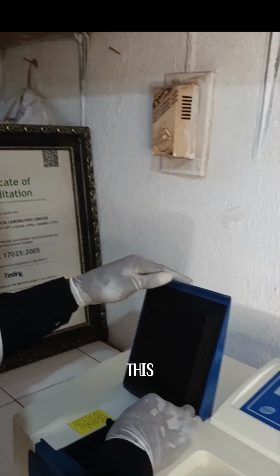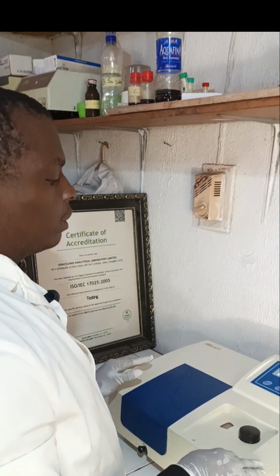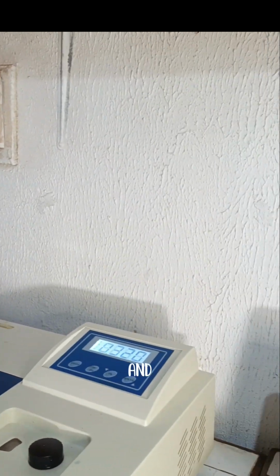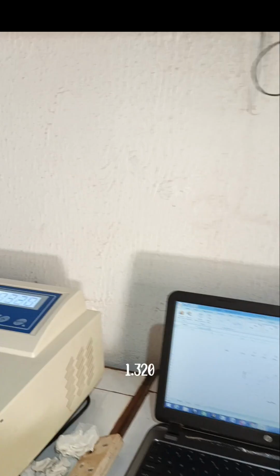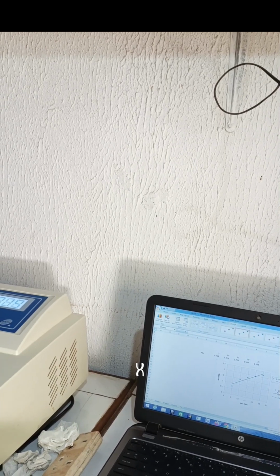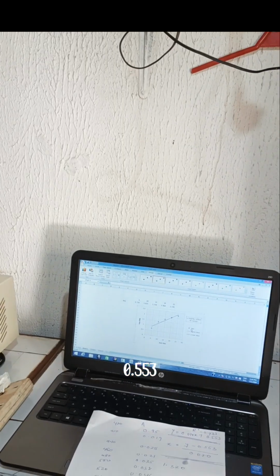And then put it in this sample holder. Now you can see that the machine is still set at 0. Then we draw the cuvette to where the sample is. And then the absorbance of this sample is 1.320.